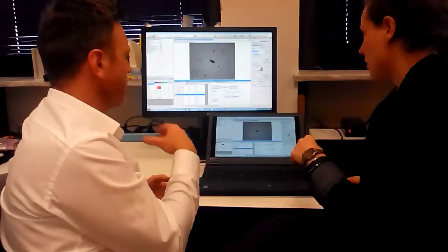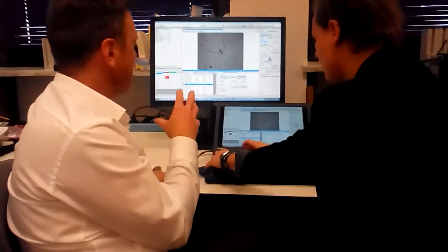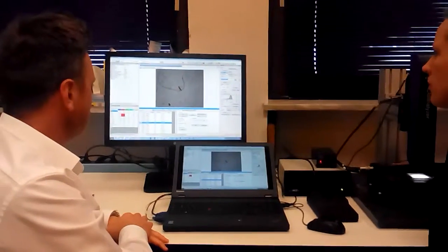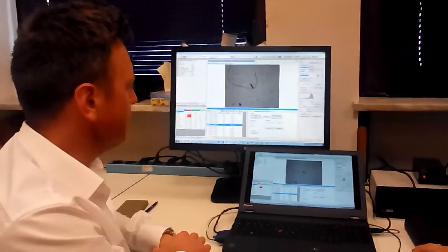And this is all leading to us showing you the report module, which is coming next. So things that we're marking here will then feature in the report that we create, which again is just literally a one-click button. Okay, that's good. So should we do this? Let's do that. Let's have a look at the export.